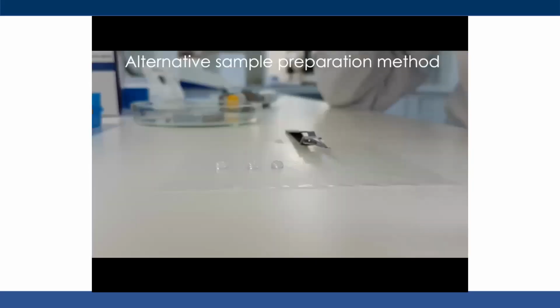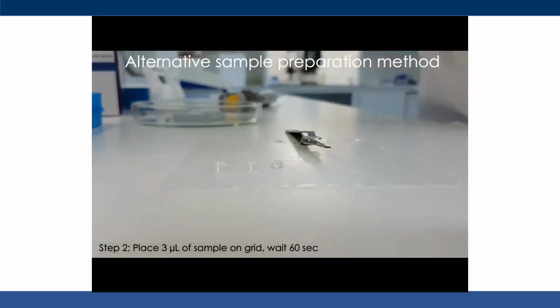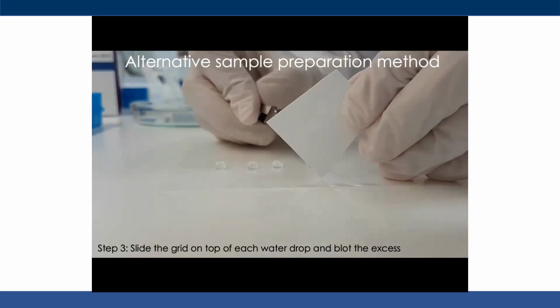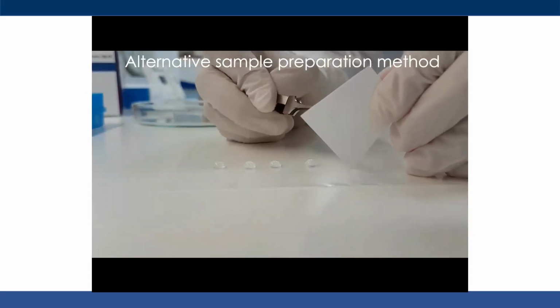There is an alternative method for the washing step. This alternative washing method can be used for VLPs or lentivirals to remove more debris. Place 3 drops of ultra-pure water on a parafilm. Also, place a drop of stain on the parafilm. Slide the grid on top of each water drop and blot off the excess liquid after each drop.